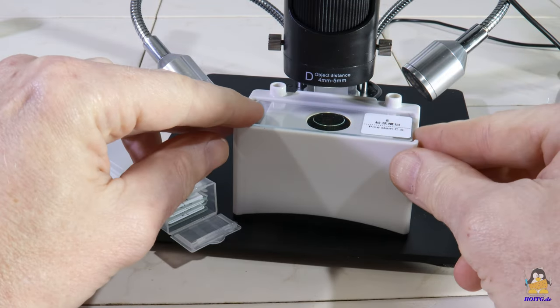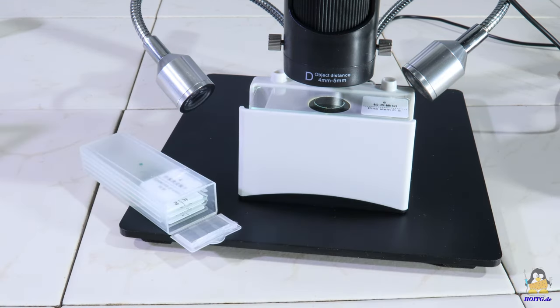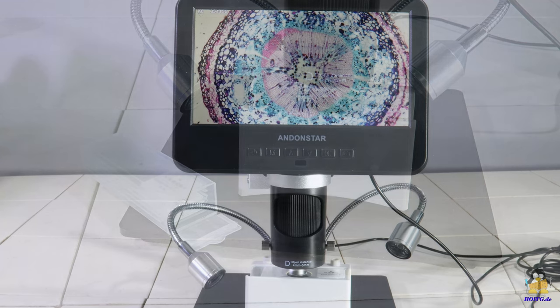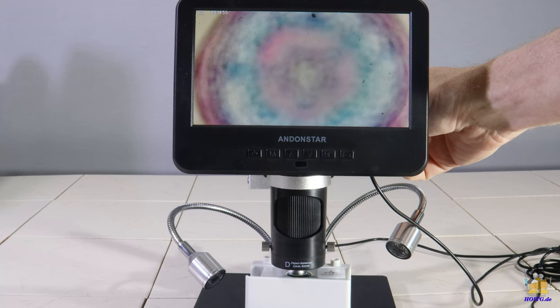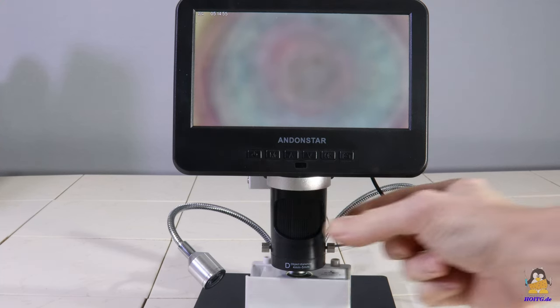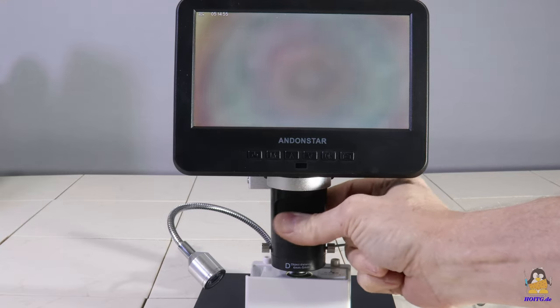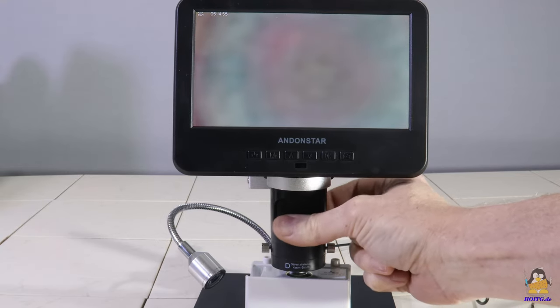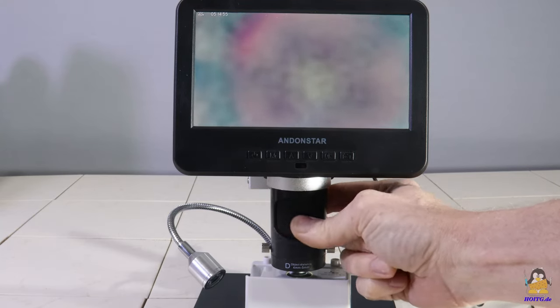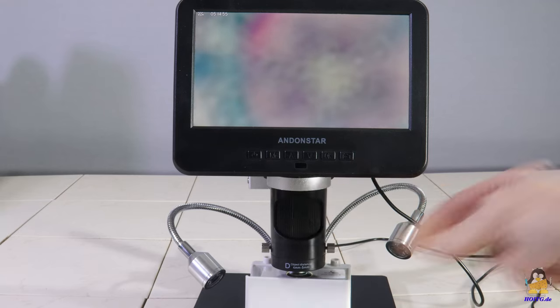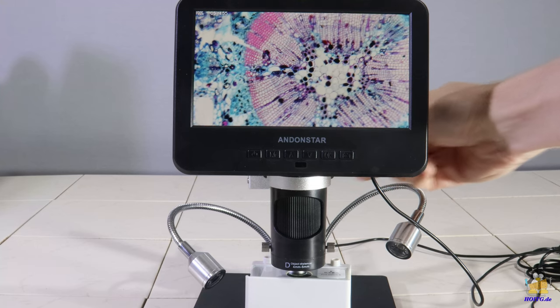Included in the package are a couple of sample preparations. When focusing on the tube, it can be seen that the microscope isn't rock solid. As soon as you touch the adjusting screw, the focus point shifts visibly.